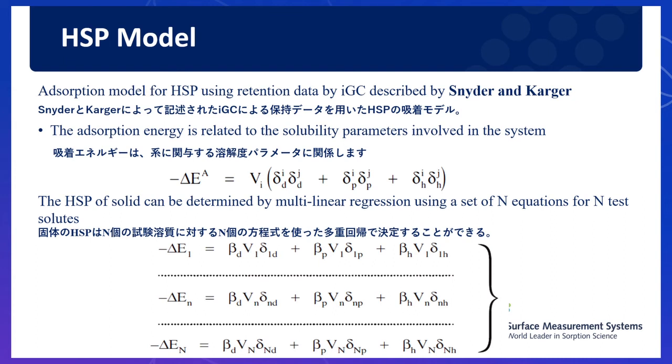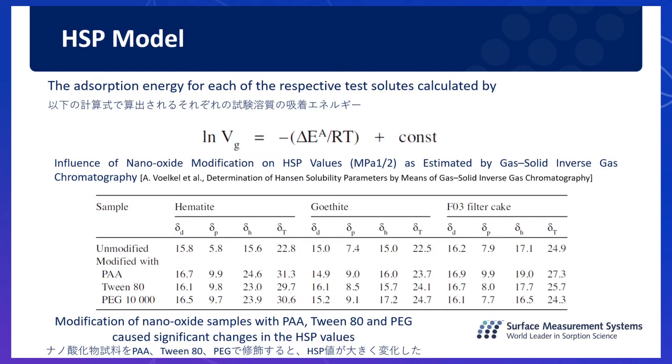And the Hansen solubility parameters of the solid can be determined by multilinear regressions of these equations.